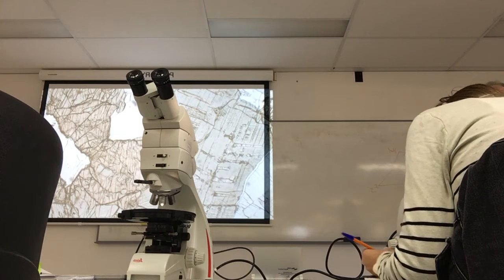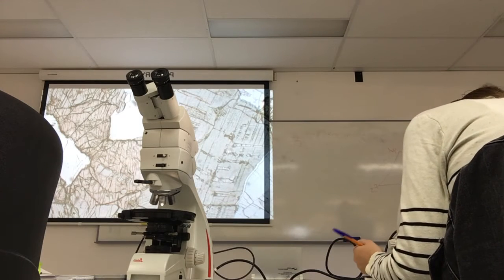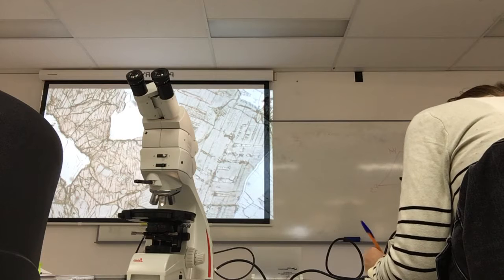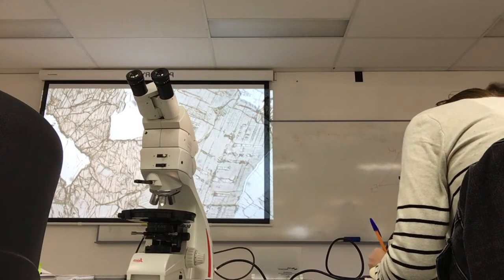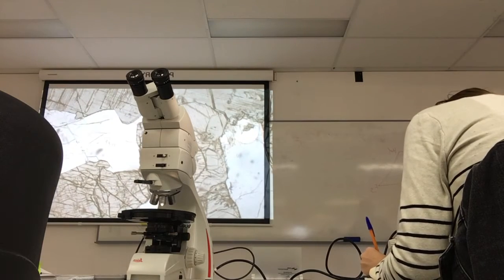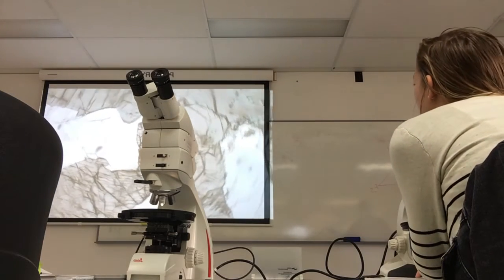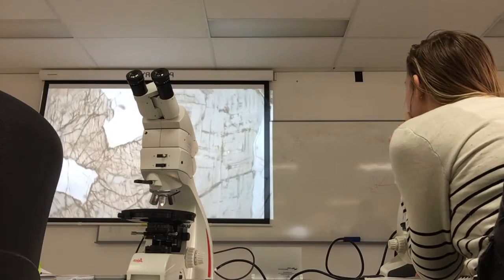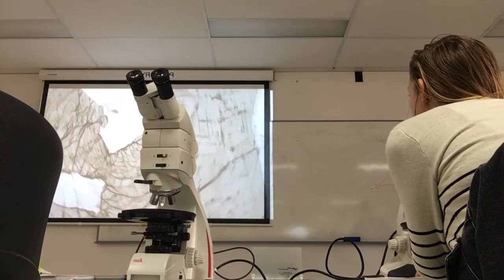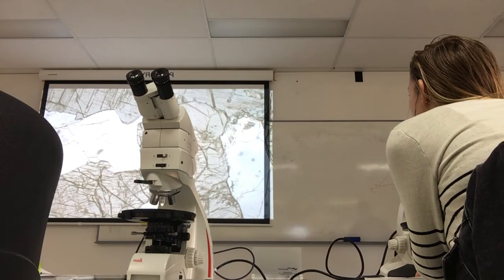The pink's the hypersthene. Okay. The green, this green that's not pleochroic, is the augite. Notice that when you turn that there, the hypersthene becomes almost the same colour as the augite, but not quite. But this is probably one of the most obvious pleochroic changes in pyroxene that you'll see.